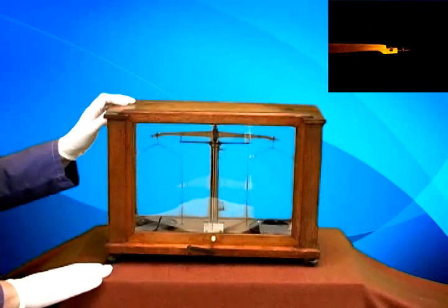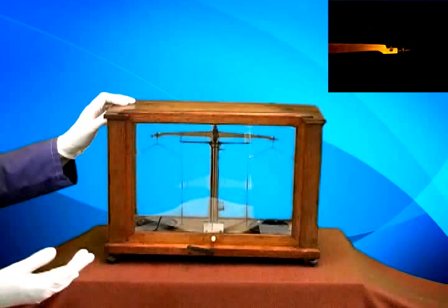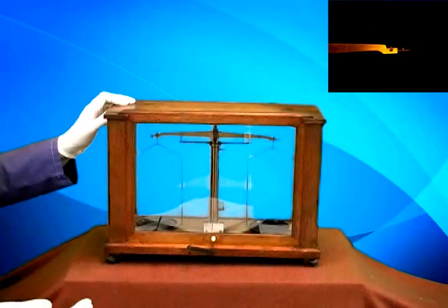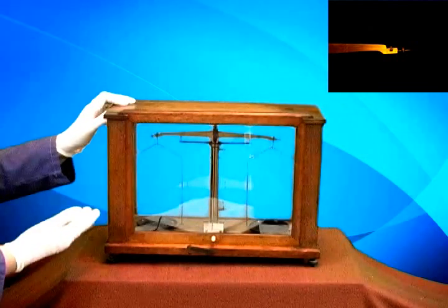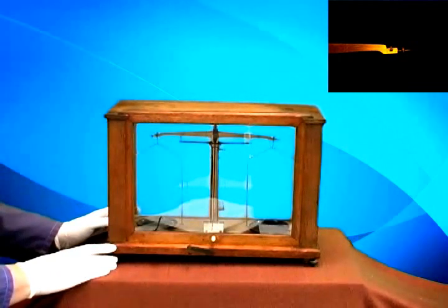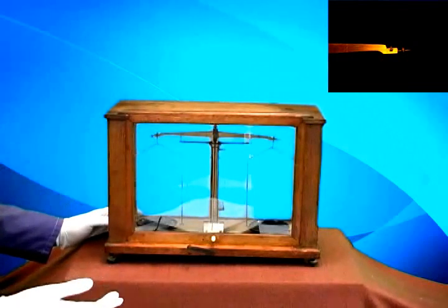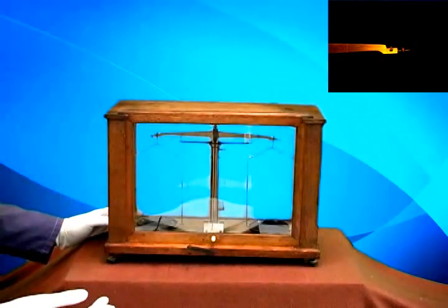Balances of this particular style made their appearance in the late 1700s. And since Dalton died in 1844, he probably had one of these. This particular balance was built in 1890 along the same designs as the type that probably would have been used by Dalton and other chemists of that period.